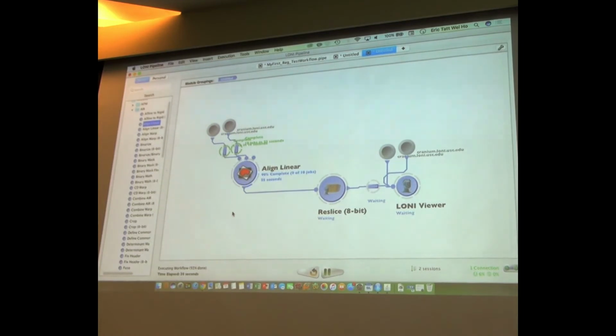So, okay, note, you guys, this is now successful. So I've proven to myself that I need to swap that module in the previous workflow, and it's going to run end to end, hopefully. But before we do it, let's just make sure it does run all the way. Oh my gosh, it's going to be painful. It's going to show 10 times the inputs, the outputs, all these things. I can stop it, of course. I can always terminate it.